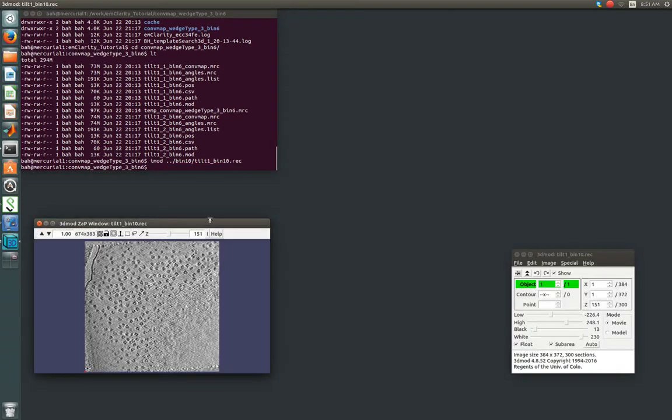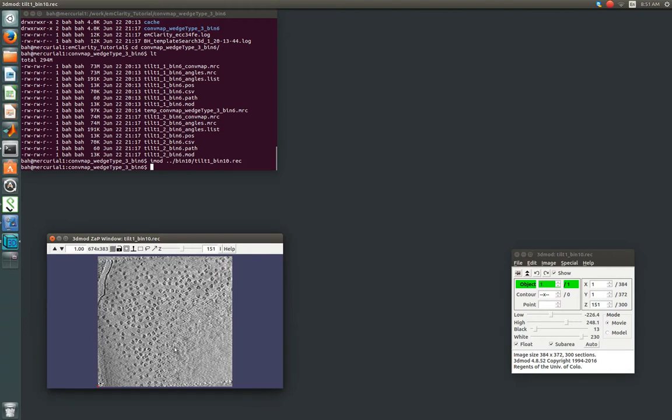And that's just to give us a reference, so we can relate what the images we're seeing here to our convolution map are.